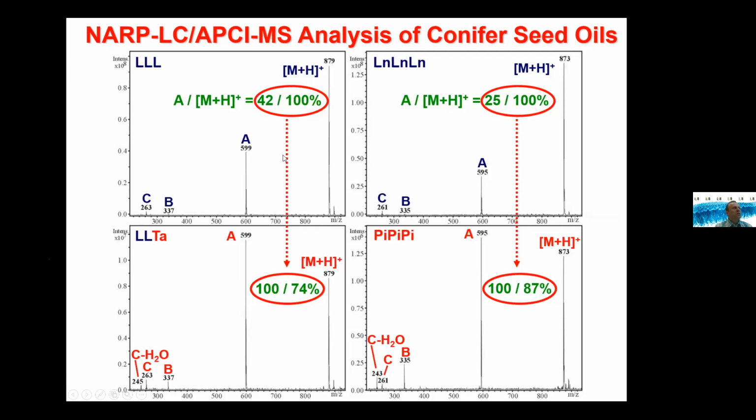Further, you should also check mass spectra, and you see that the ratio of the protonated molecule and this first fragment ion after neutral loss of fatty acid is quite characteristic for these unusual double bond positions. Of course, we have also verified by available internal standards that we are really correct.